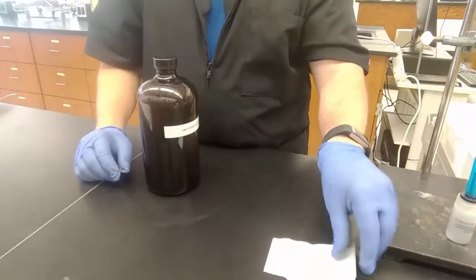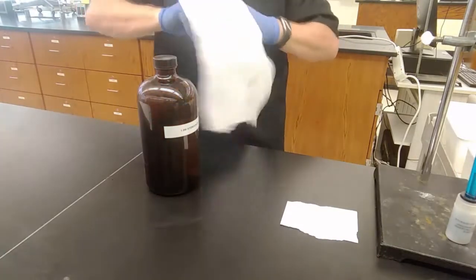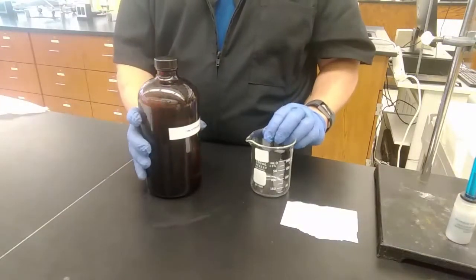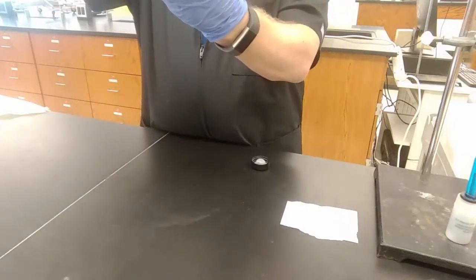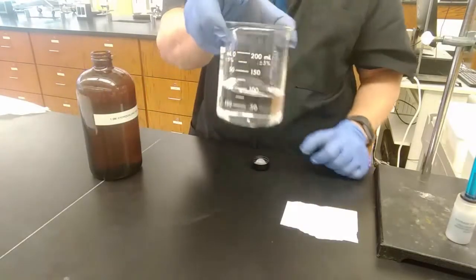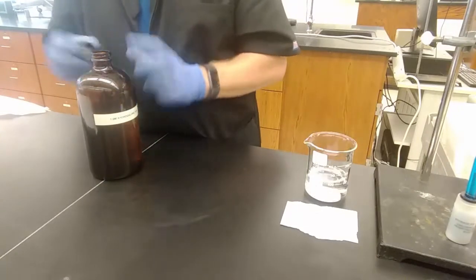And so I'm going to get a 250 milliliter beaker that I have just cleaned. And I'm going to dry it off, if for no other reason than just for visibility purposes. And I'm going to put about 100 milliliters of the acidic solution into the 250 milliliter beaker. Now beakers, just like flasks, are not precision measuring devices. This one says right on it, plus or minus 5%. And so I have around 100 milliliters, but that's all I need.